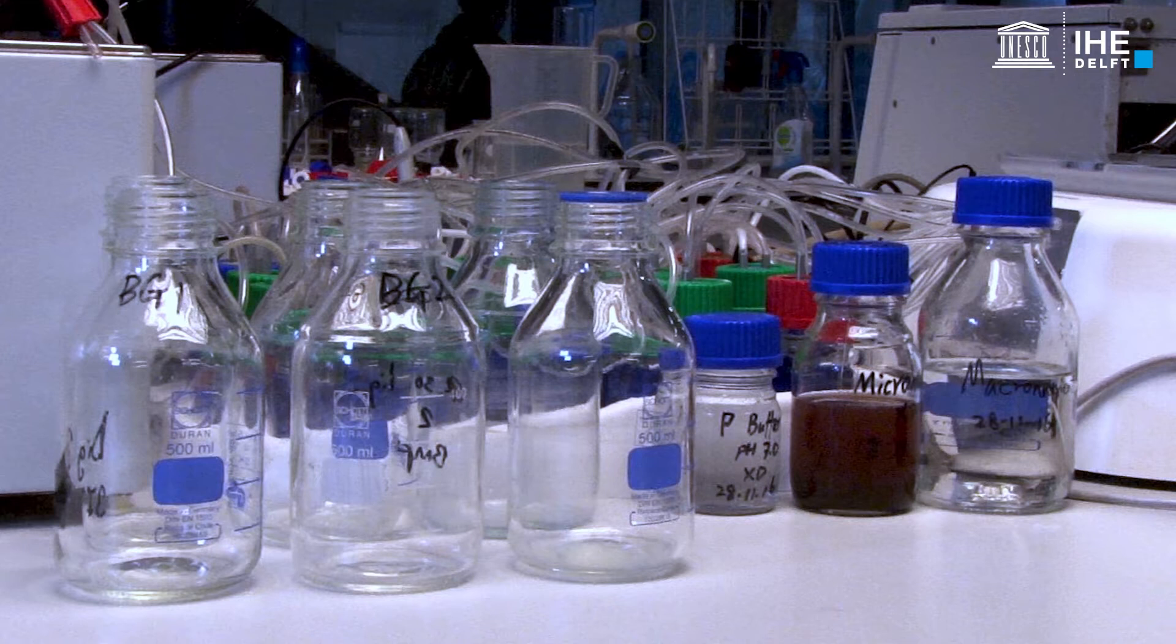The BMP test is carried out in triplicate. First, mark all the bottles clearly - three blanks and three samples. The blank bottles are filled with inoculum and demi-water, and the sample bottles with sludge waste as substrate and inoculum.